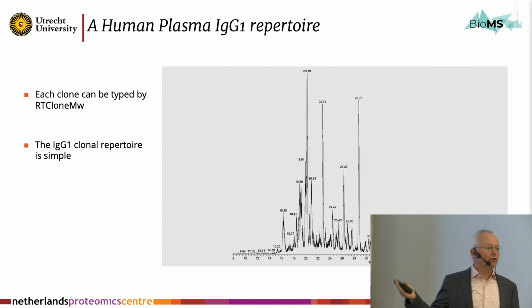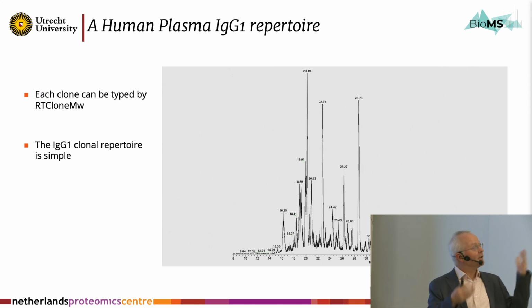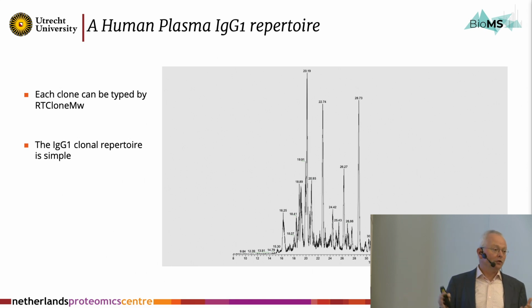Now, the strange thing came when we did this the first time, and this was the LC-MS chromatogram of the data. And I like to show this. It's not a beautiful figure, but it's the original one. And today I enjoyed how nice it is to see original ones. But this is our original LC-MS. It looks, for people who are in proteomics, almost like a tryptic digest of BSA. It looks very simple. There are a few dominating peaks, maybe 100 or 200, but it doesn't look like there are 10 to the 9th or 10 to the 7th or 10 to the whatever peaks there.